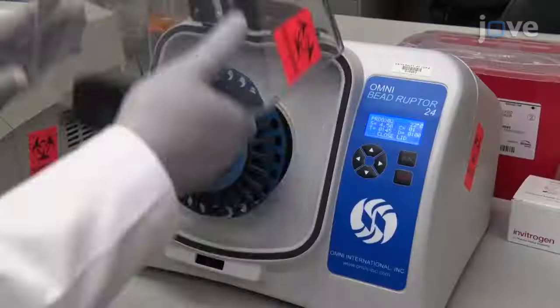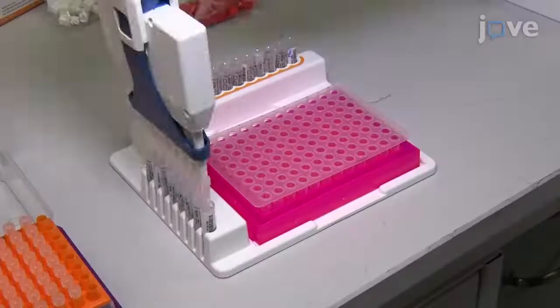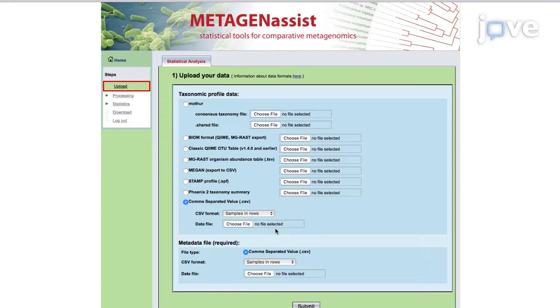Profiling of microbiome is the first step toward defining the role of microbiome in health and diseases. Here, we are describing a simple procedure for isolating high-quality bacterial DNA from fecal samples, preparing library, performing 16S rRNA metagenomic sequencing, and microbiome data analysis.